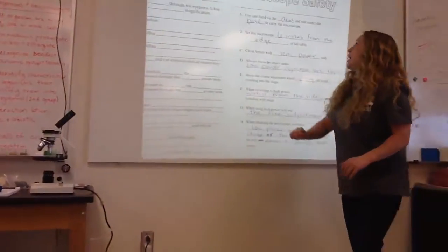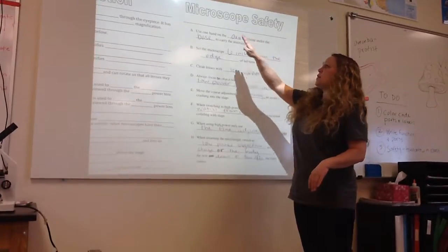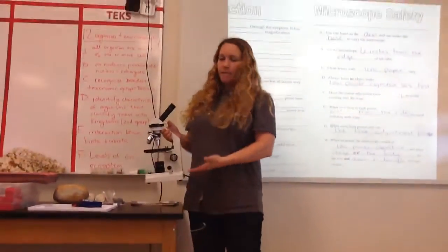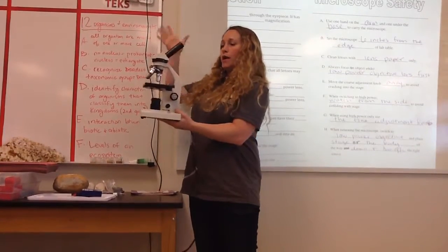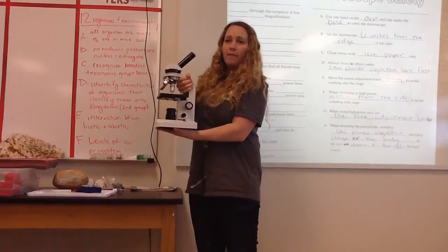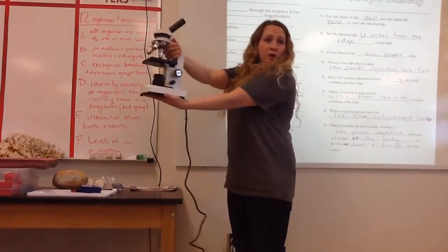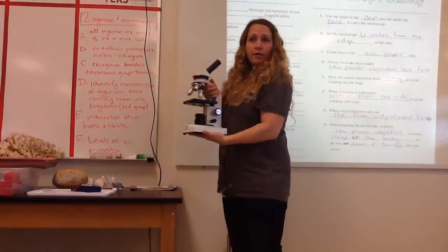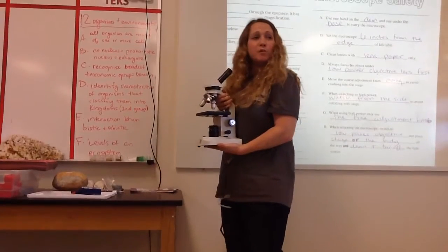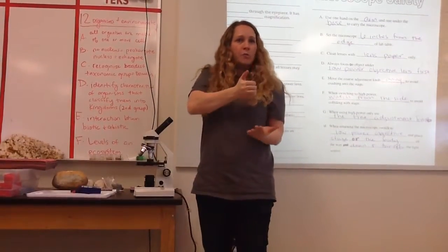So the first thing is, how do you carry the microscope? You use one hand on the arm and one hand on the base, and you always carry it like that. So the arm is this part, and the base is this part. One hand goes on the arm nice and tight. The other hand sits flat, and it sits on top of it. There's one more part. You need to hold it close to your body. You're not serving drinks at a restaurant. You're holding a microscope and keeping it safe. So hold it this way. Can I see you please try that? Everyone, base. Arm, close to body.